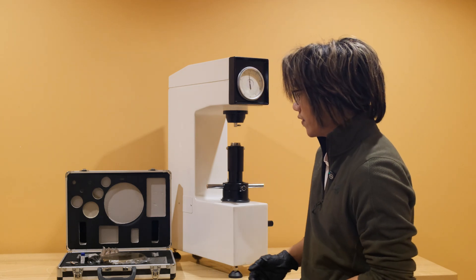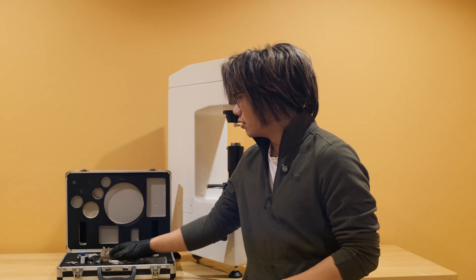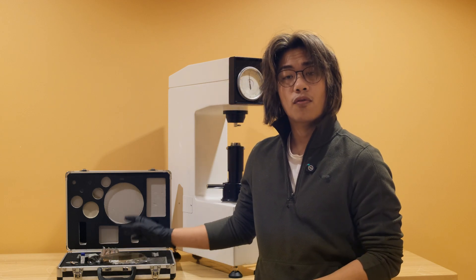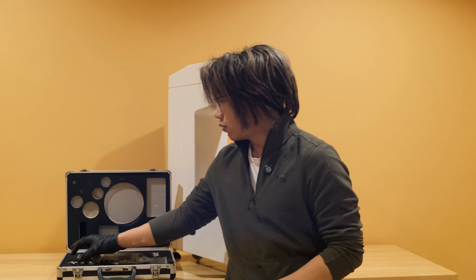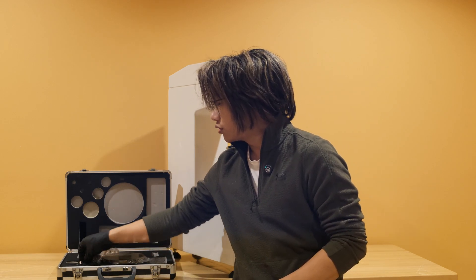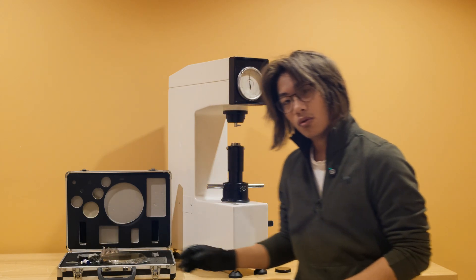In the kit for the 900-345 you will receive three weights, three anvils — large, medium, and V-shape for rounded parts — four calibration blocks, a 1/16 inch ball indenter, a 120-degree cone diamond indenter, and four leveling feet.